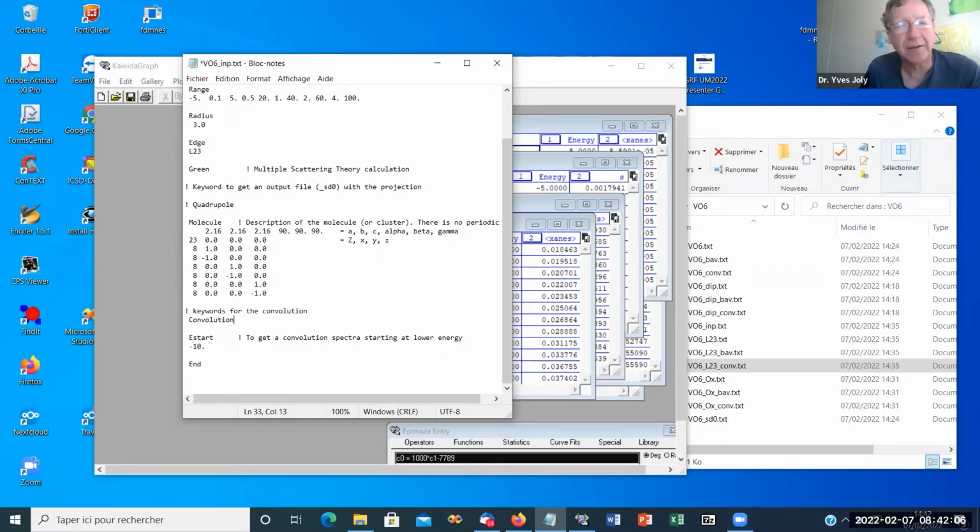Now, if you compare with experiment, some details are not in the simulation, and to have these details you need to also put in the hydrogen atoms. So I did that. I considered the water molecule, with a fixed distance between the hydrogen atom and oxygen, and I set the hydrogen atoms, and indeed this improved the shape.